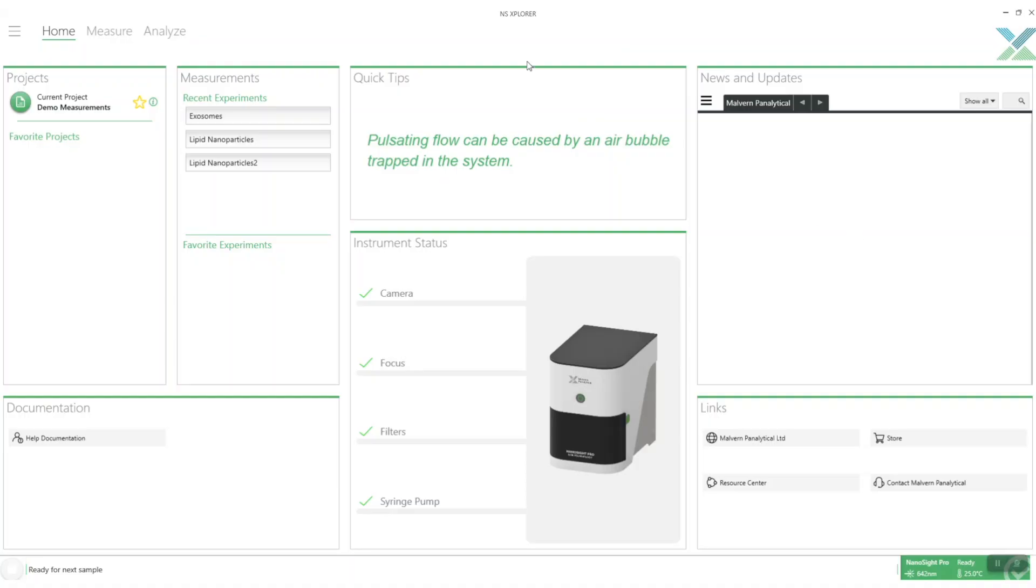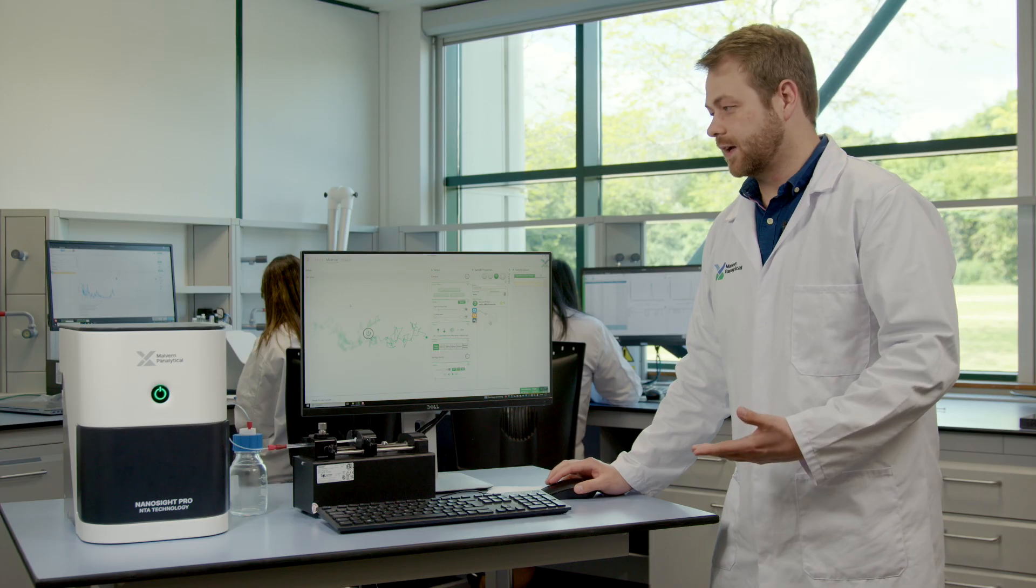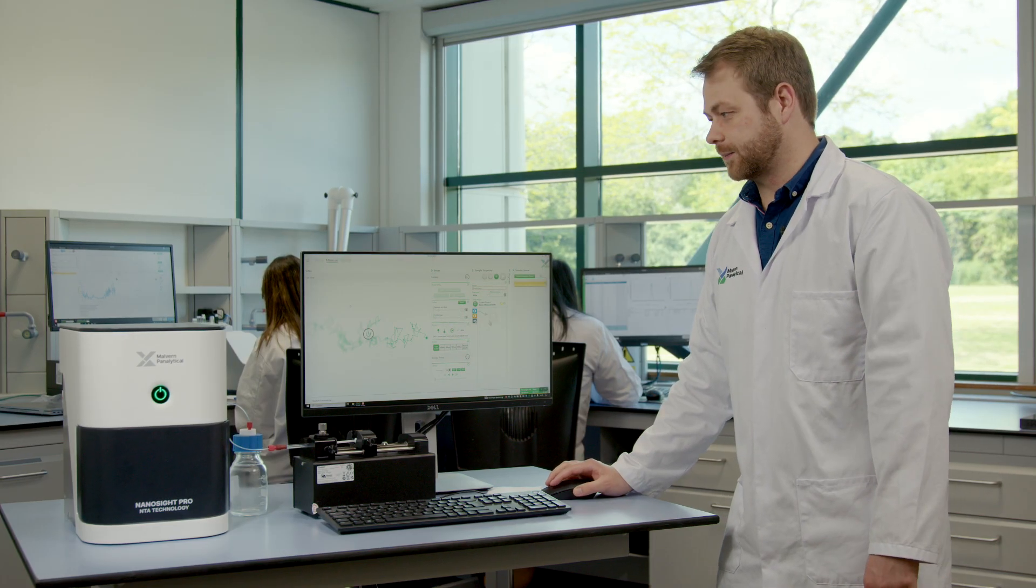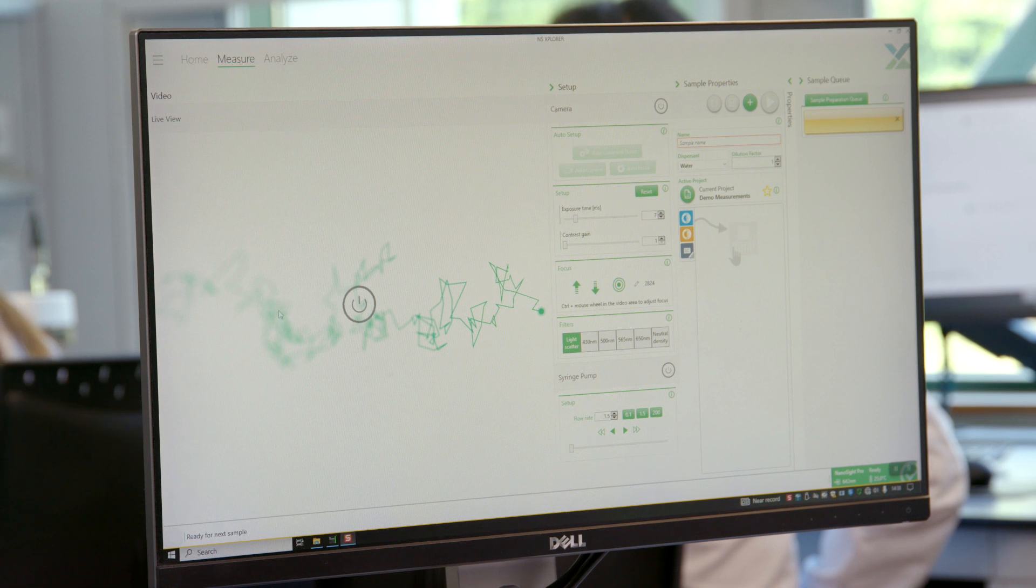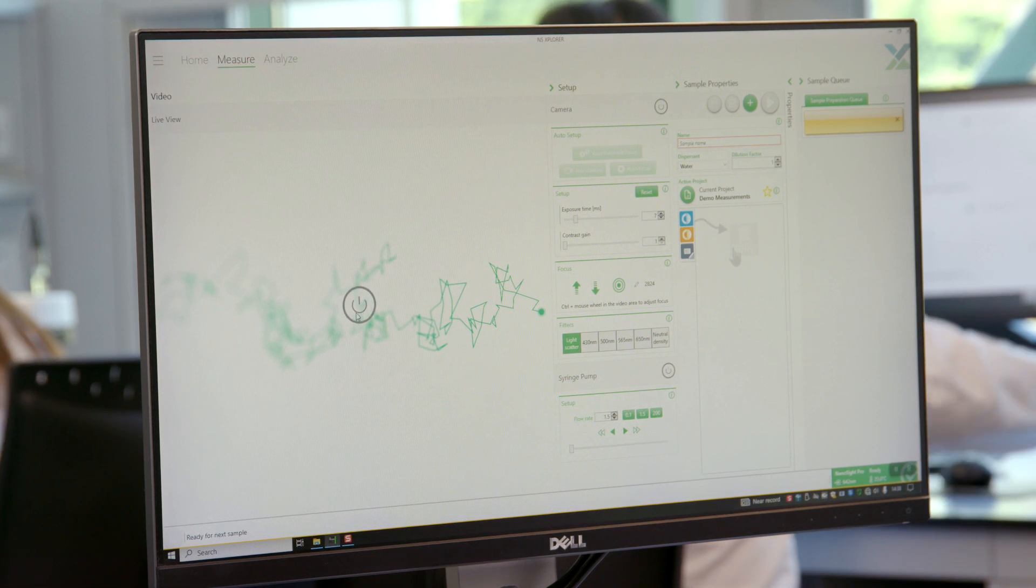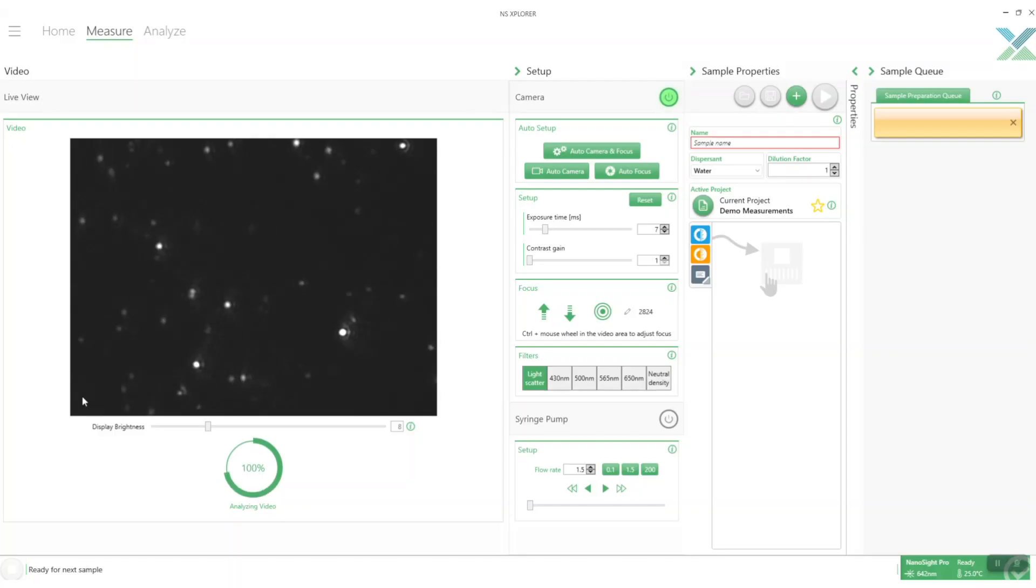Where we set up our measurements is in the measure page. Here is where we can set up our measurements and capture them. If we start the camera immediately we should see our particles. Here we can see these dots dancing around on the screen and each one of these represents a particle.